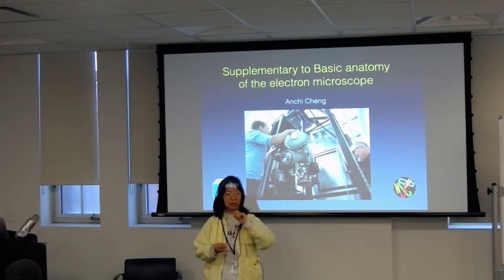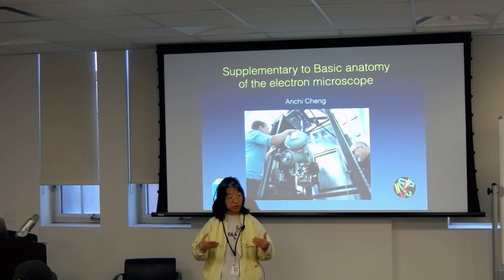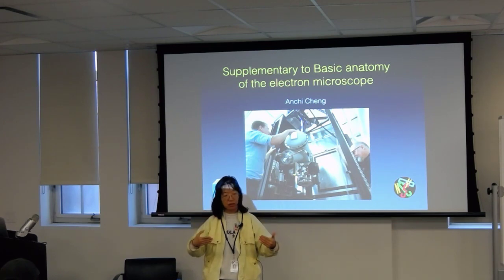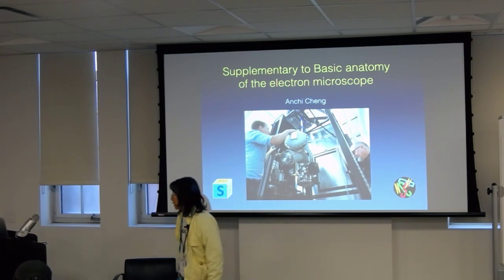This is what I found very interesting, because I saw in there a phase contrast and what happened when I defocus, how my phase actually gets reversed. It was very interesting to see what we consider a good image in an optical world and what we see on an electron microscope. So those are all pretty valuable things to learn from it.